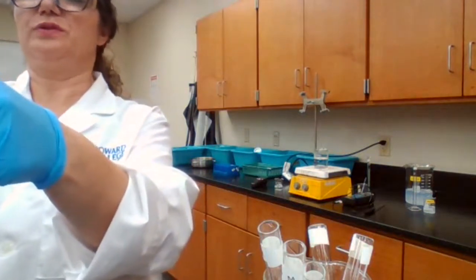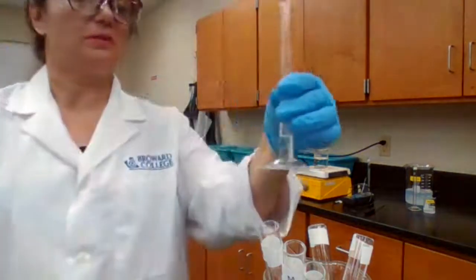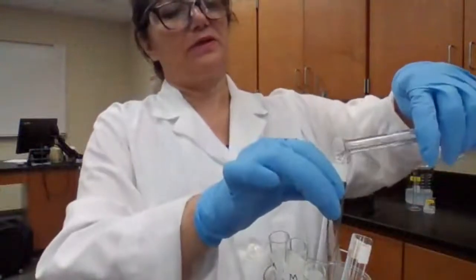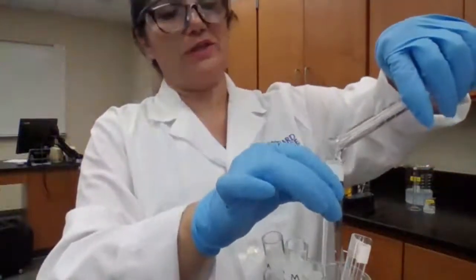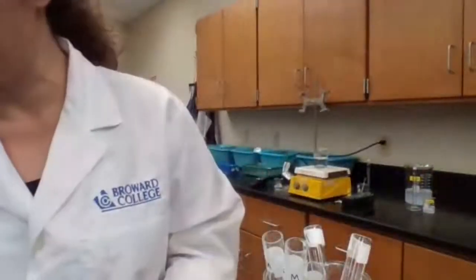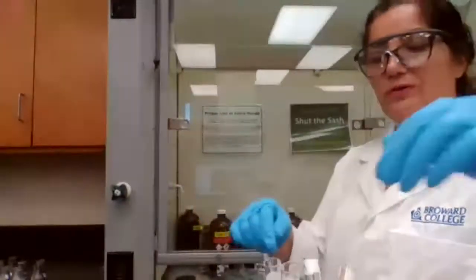For test tube 2, it says add 2 milliliters of water. I'm adding 2 milliliters of water to test tube 2 and 8 milliliters of the acid. When you read the procedure from the lab manual, it's going to make more sense why I added the 2 milliliters of water to one of the test tubes, because it's trying to lower the concentration. At the same time, it's teaching you how to get the concentration of a solution by dilution.